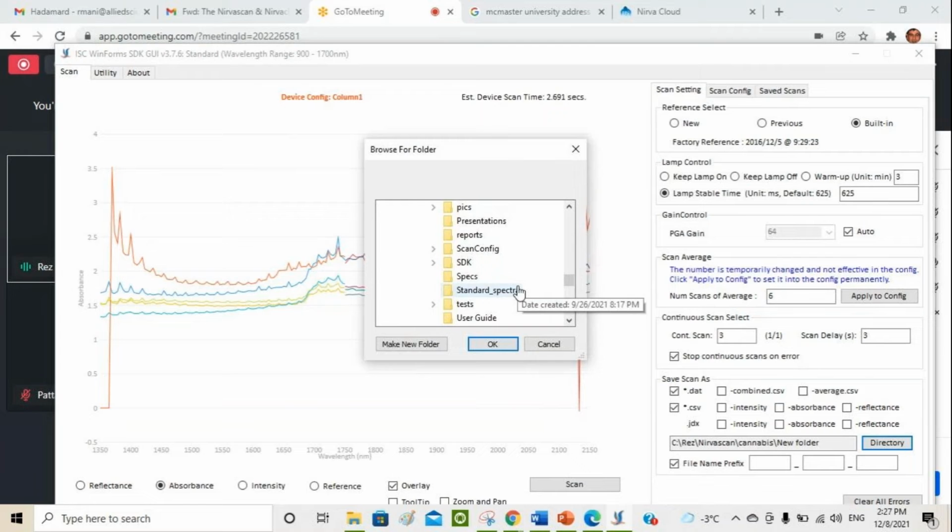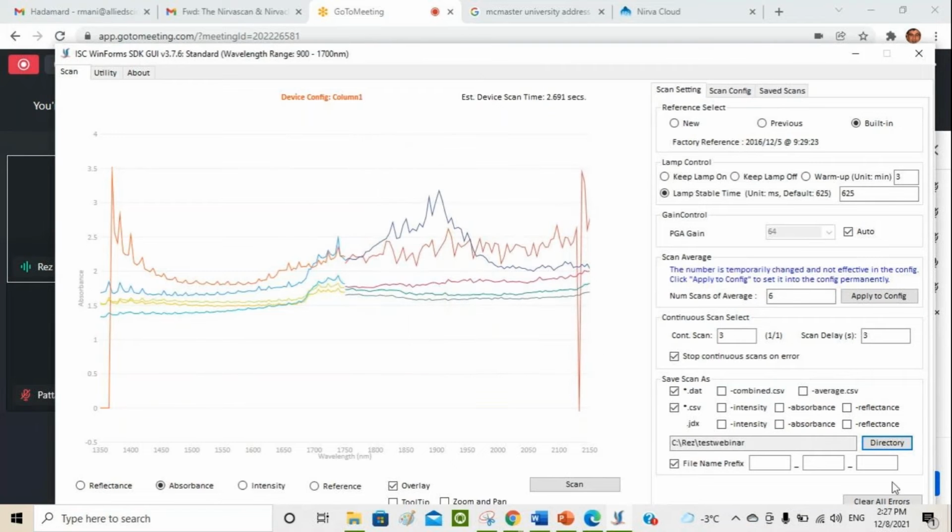Is there a directory called that? Okay, let me make another one called test webinar. Yes, it is in test webinar. So C, res, test webinar, and then I'm just going to call it test NIRvaScan.